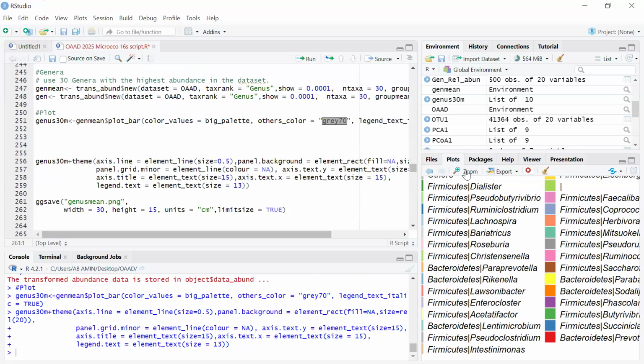Is this plot going to show? Maybe you can increase that panel. When you click on the environment, I think then it can go up a bit. Okay, should I decrease the panel or increase? Yeah, you can increase it so that we can see it. Can you see this page now? We cannot see the page because if you use Zoom, we cannot see it.